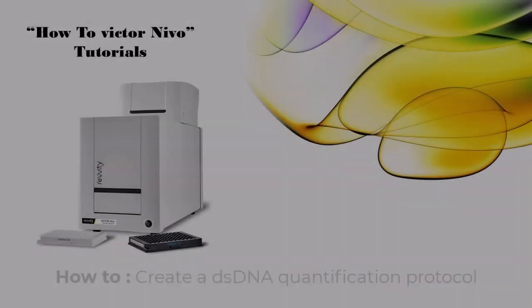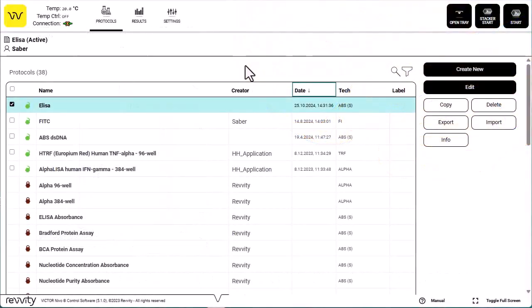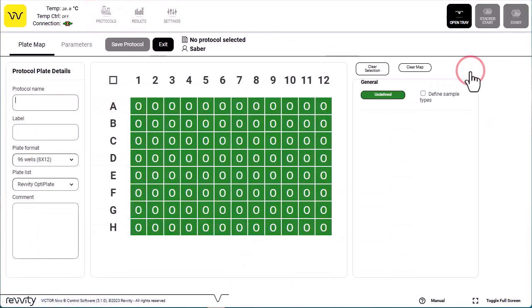Welcome to this How to Victor Nivo tutorial that will guide you step by step in creating a double-strand DNA quantification protocol. Do not hesitate to pause between the different steps.